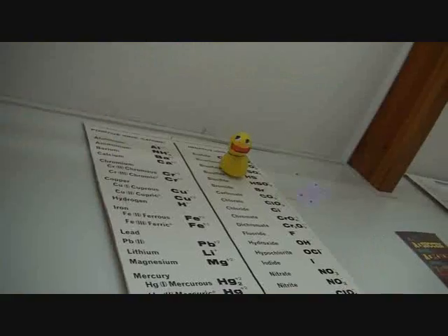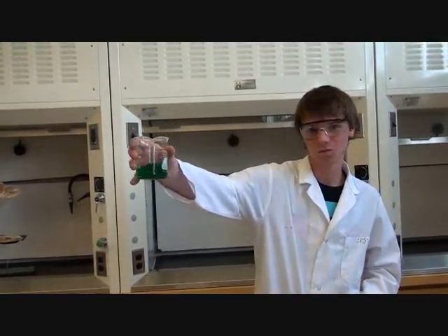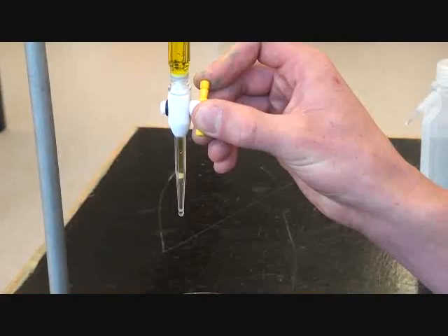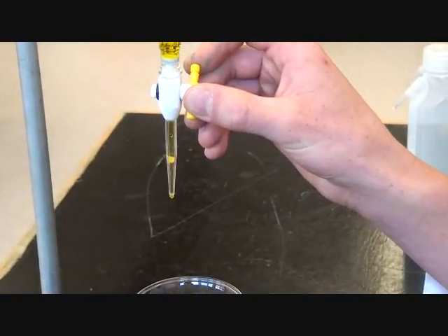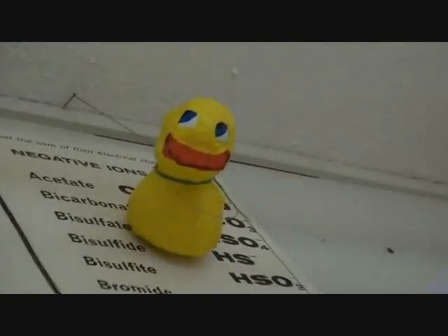Into the acid, pour some bromothymol blue. When neutralized, the color green is what you view. You've got to be accurate to the nearest drop. One drop too many and you have overshot.